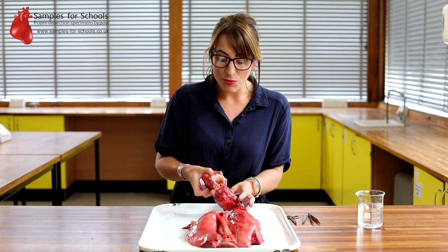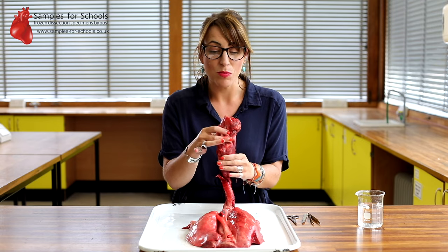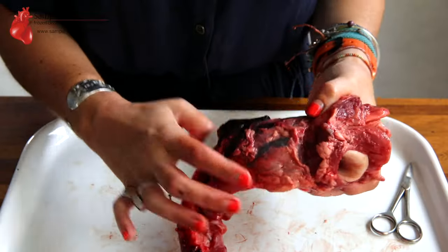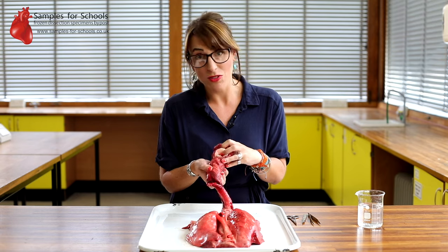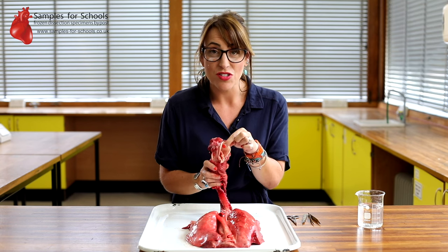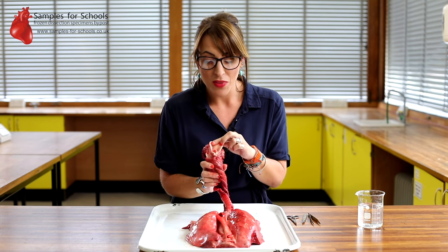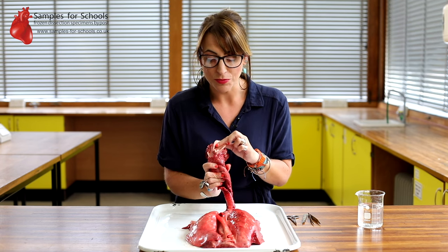The first thing we can notice is the larynx attached to the top of the sample. This is the voice box, and it houses the vocal cords for the animal to make their noises. But what we can see here is the entrance to the airways that we're interested in. We're going to be looking at the trachea, the main windpipe of the animal.